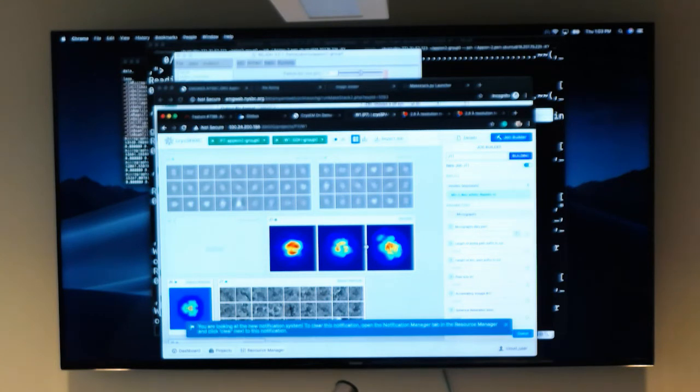Class we don't want to use, so we just want one. My protein would not have any symmetry. You want 3? Should it matter for this one? No, you can do one. 1 to 4, yeah. Clear it and try running again first. Clear job and clear it.